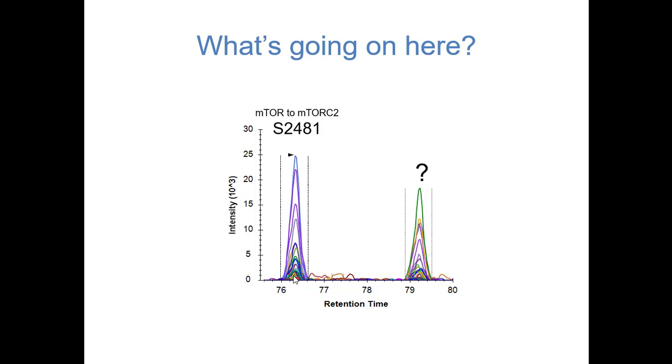In an Orbitrap, actually, you end up with an alternate effect on the top end as well, as a result of coalescence. That's where if you've got a high population of one type of ion, say 90% of the ions in the trap are of one specific type, which definitely happens if you've got one specific peptide, the Orbitrap ends up drawing the masses of the other fragment ions towards that mass. And so it basically will pull them off of whatever mass accuracy they were supposed to hit.